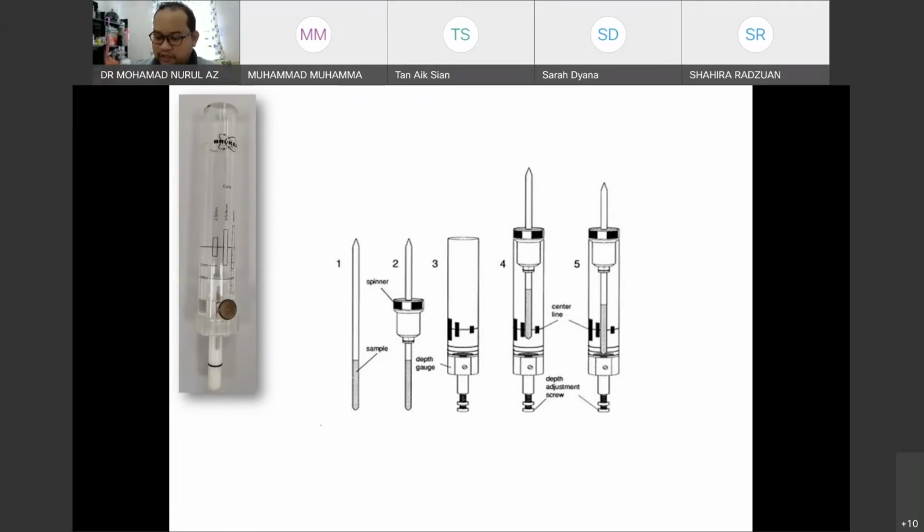It's better to clean the NMR tube, put it in an aluminum foil boat, and put it inside the oven at around 40 degrees, not more than that, because when you increase the temperature, the glass will expand.